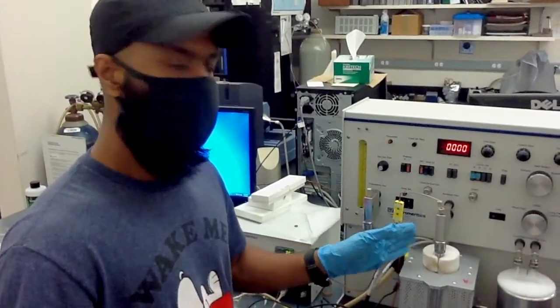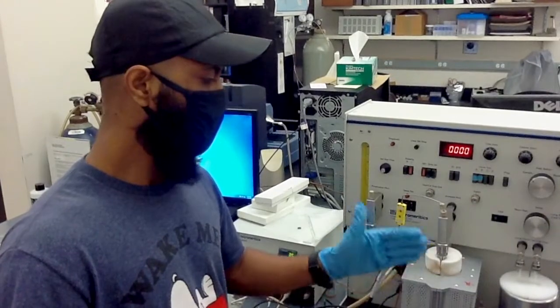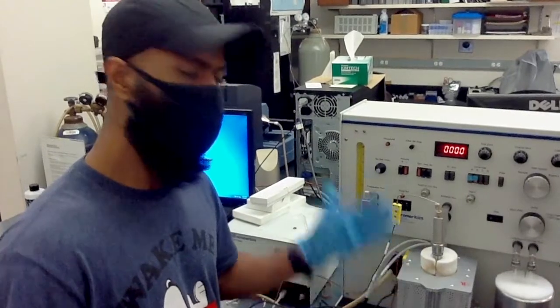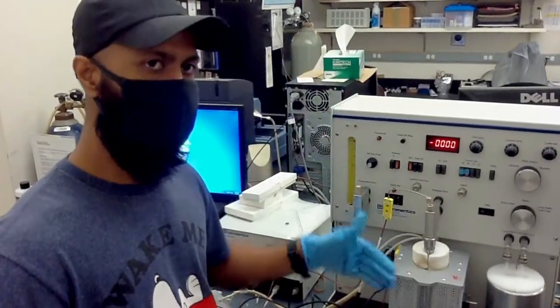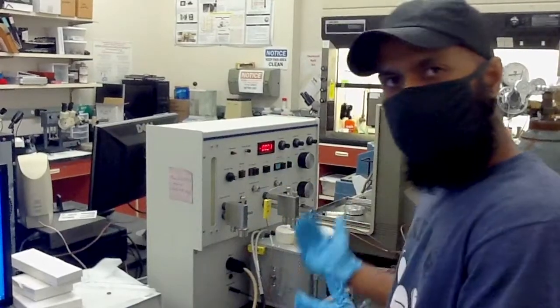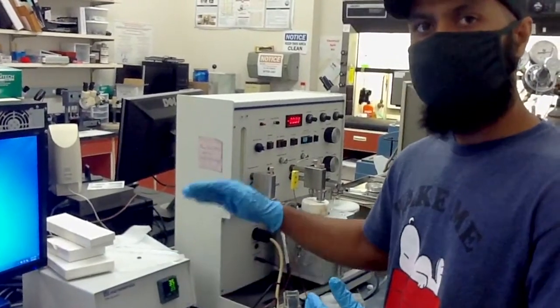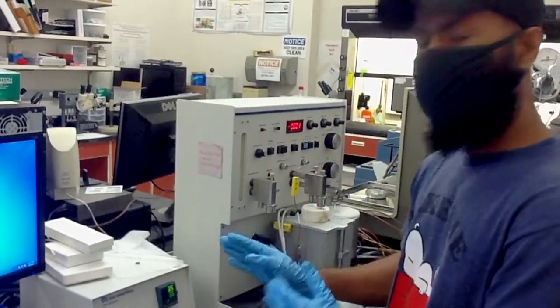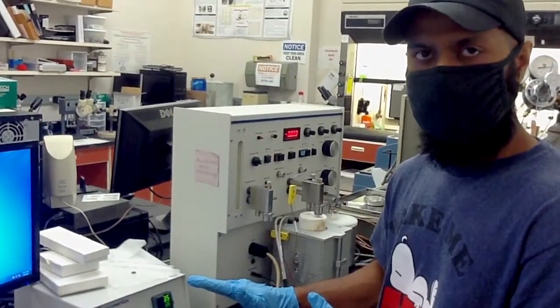So this is the same sample preparation process we will be using for most of our experiments, and this preparation we need to do under an inert gas, and in this instrument, we are using helium as an inert gas to prepare our sample. Once we set up our sample for the preparation, we have to program the temperature to reach a certain preparation temperature. In this case, for this experiment, we will set 150 degrees Celsius and hold it for 1 hour, and then it will cool down to room temperature.